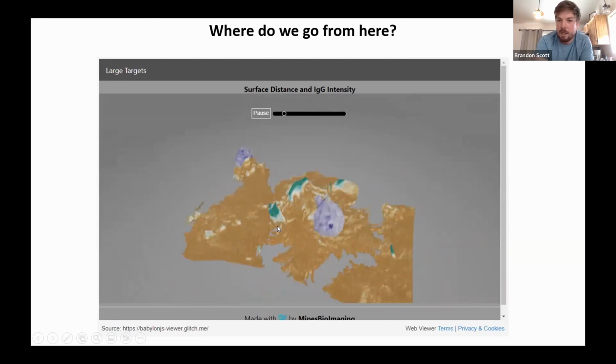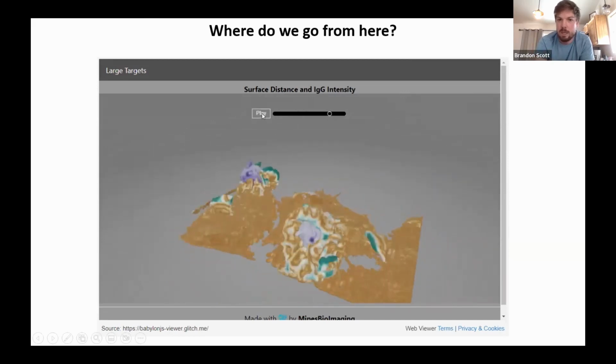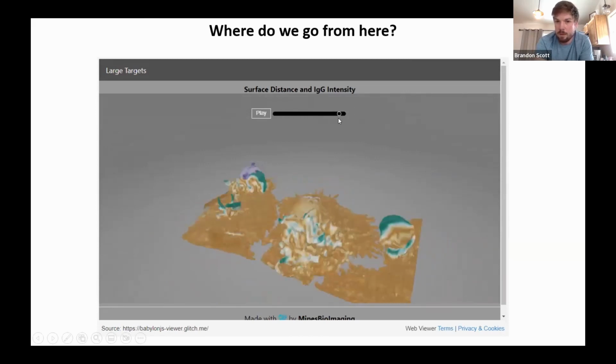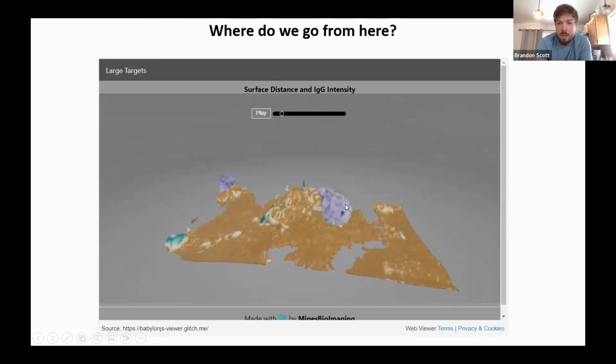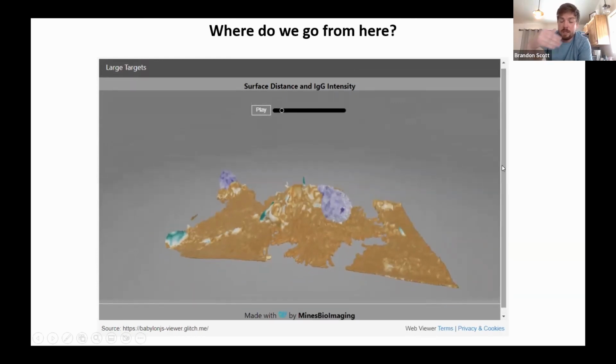So we have full interactivity, and if you had a mouse that could zoom, you could, and you can pick basically any point in time that you want, and these are going to be displayed to you in real time. And you can also do this on a cell phone, which makes getting our data from just the clusters and the HPCs into the hands of people who are most interested in seeing it.